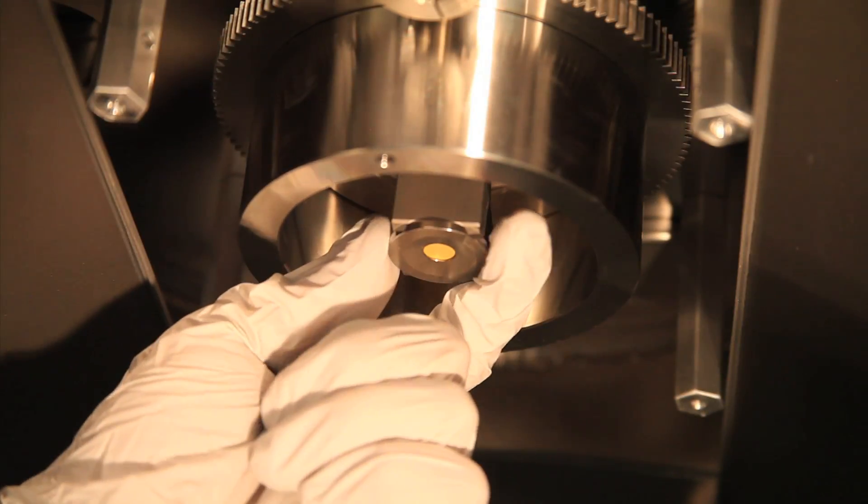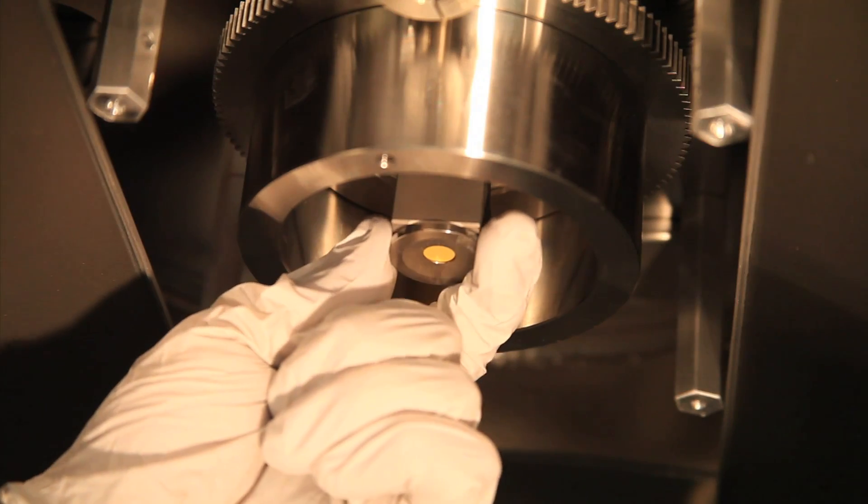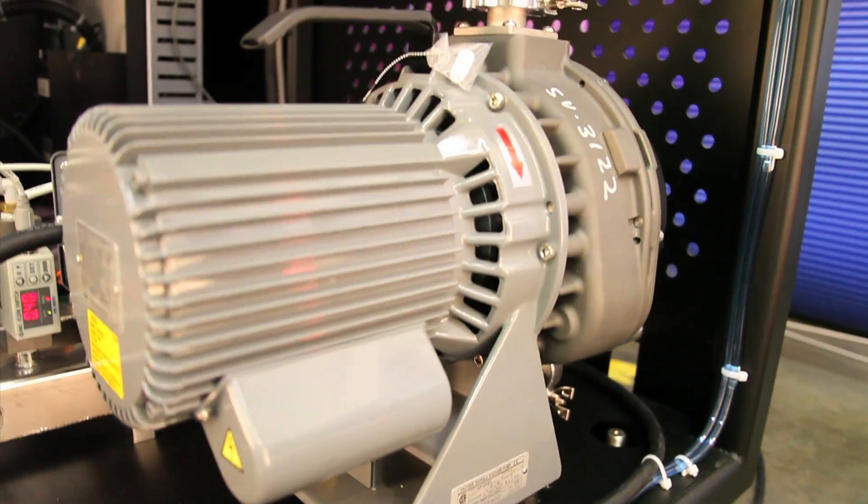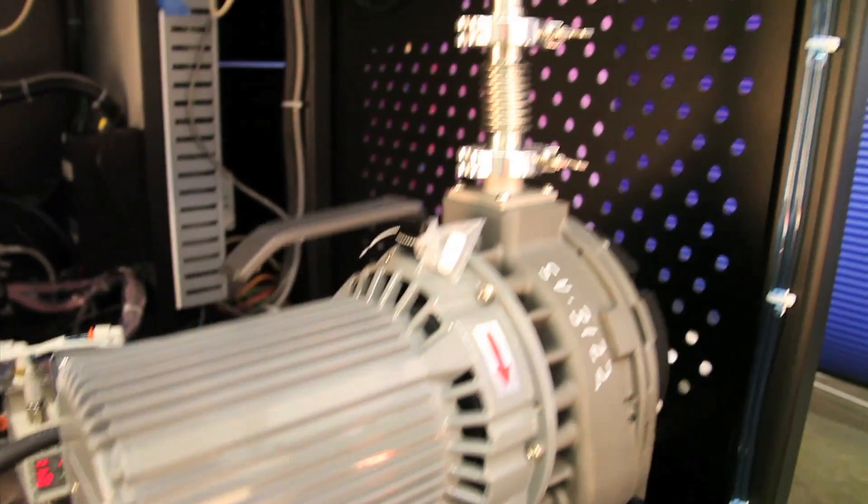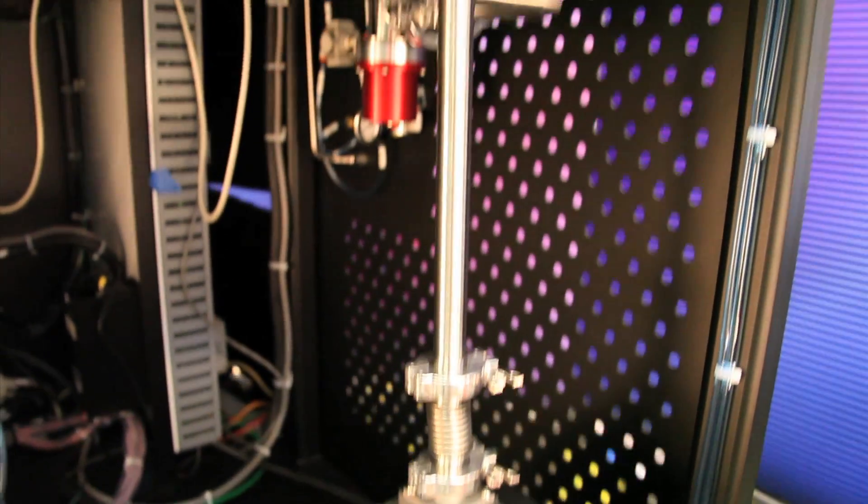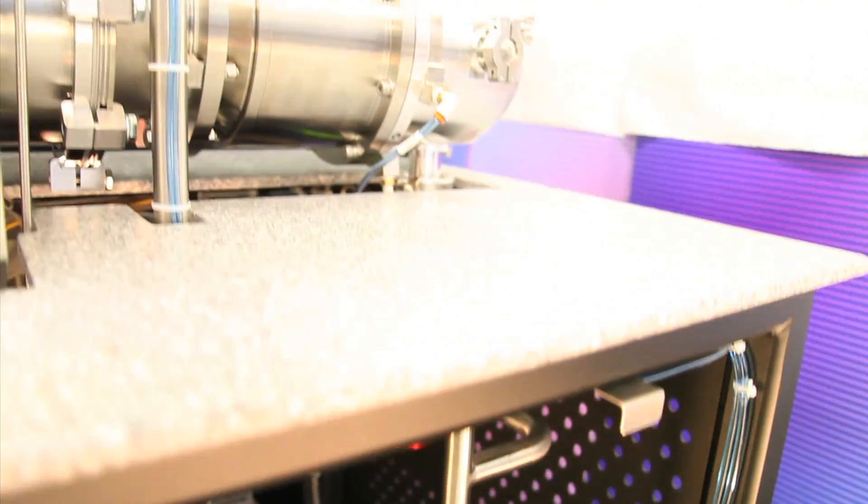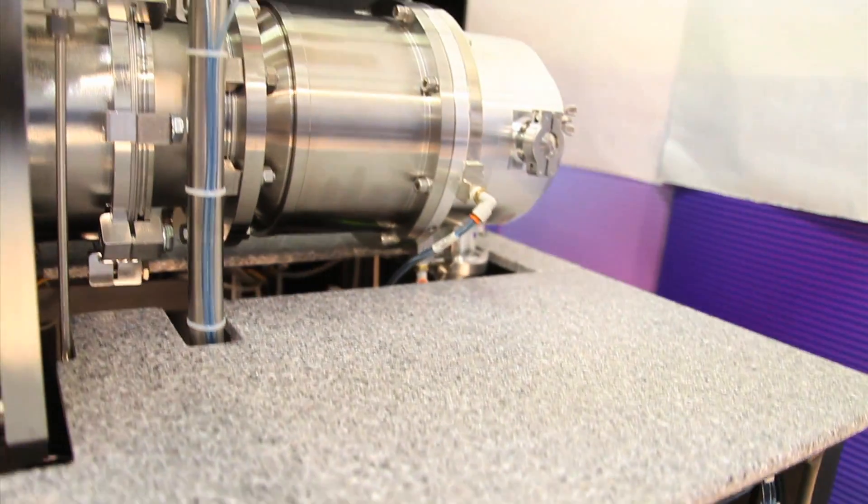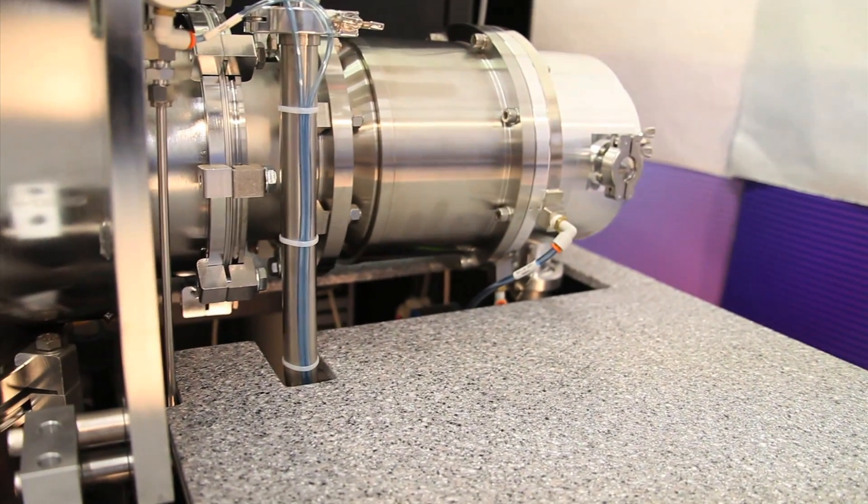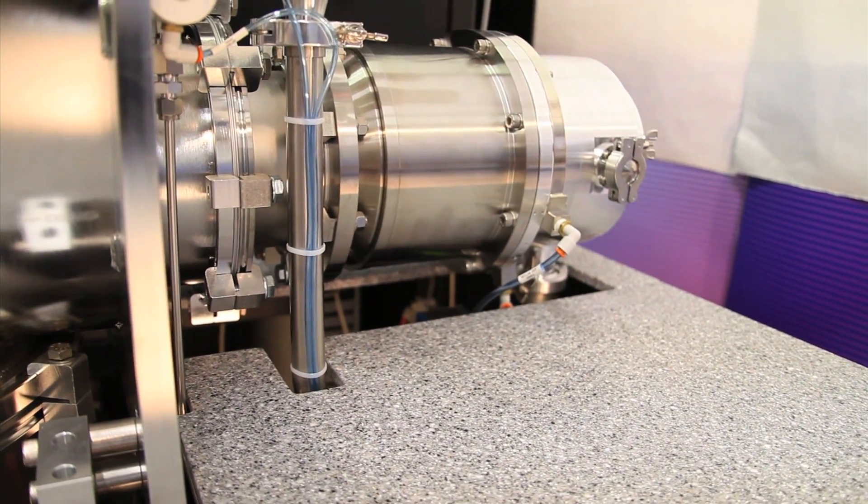The system has a single crystal rate controller. The mechanical pump is an onboard dry-scroll type pump, and the high vacuum is achieved using a turbo-molecular pump without the optional gate valve.